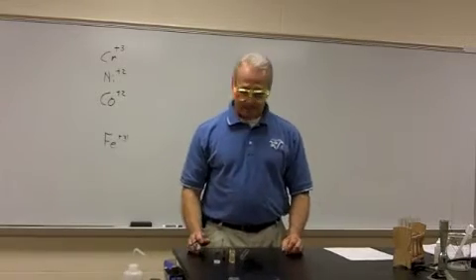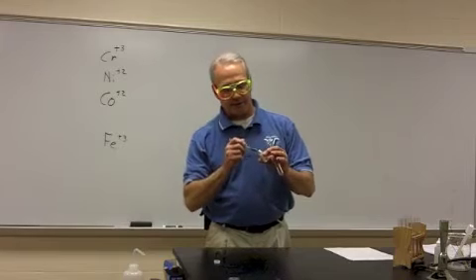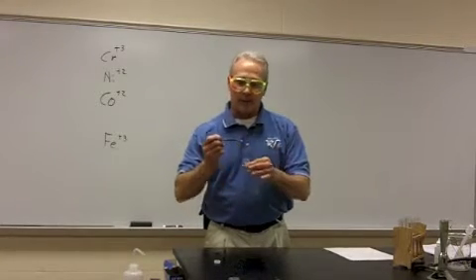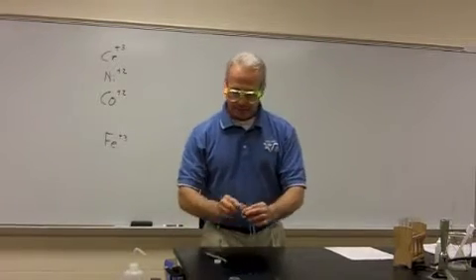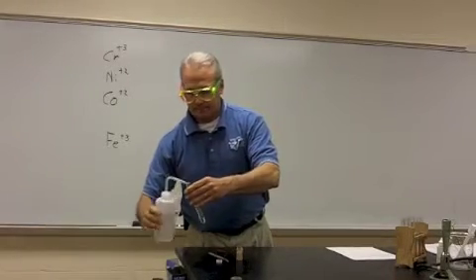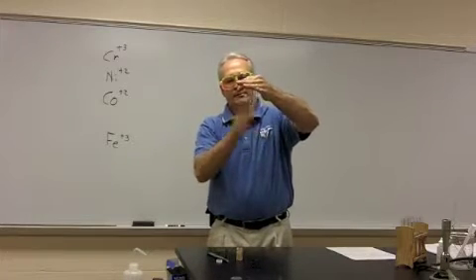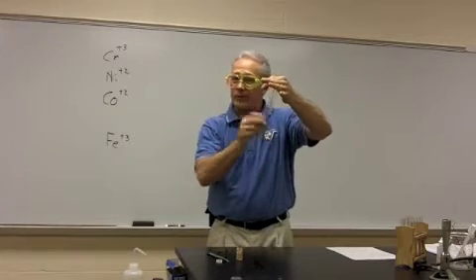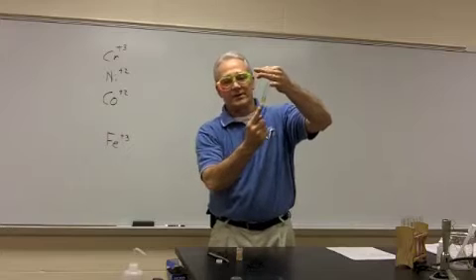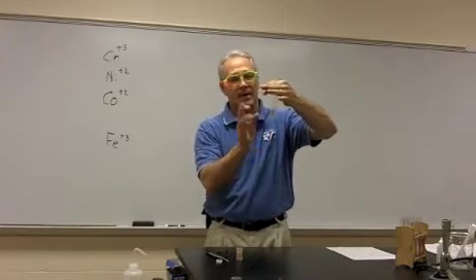The 6th and final test is called the sodium hydroxide test. With this test, again, we take a small sample of our unknown and add it to a test tube. We're going to add distilled water, a finger's width is what we always use. Beat it up a little bit, make sure it's all dissolved. That's very important on this test, because if it's sitting at the bottom here and we add hydroxide, there's not enough in the solution to make a reaction happen.